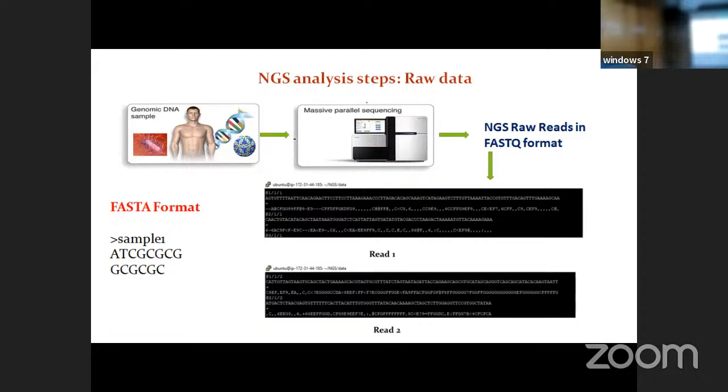That we should mention. It is 90% confidence, 95%, 99%, 99.9%. Some accuracy should be there, right? If I am telling 90%, it means out of 100 bases, there might be 10 errors.